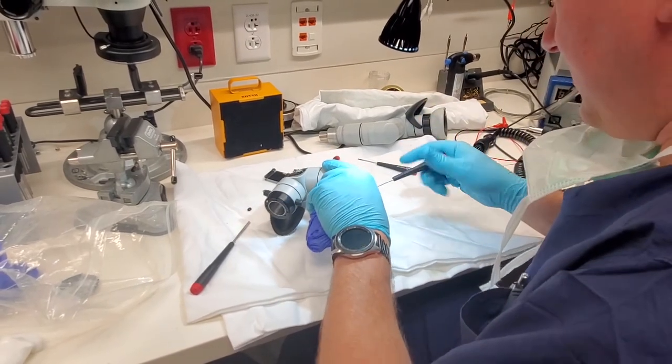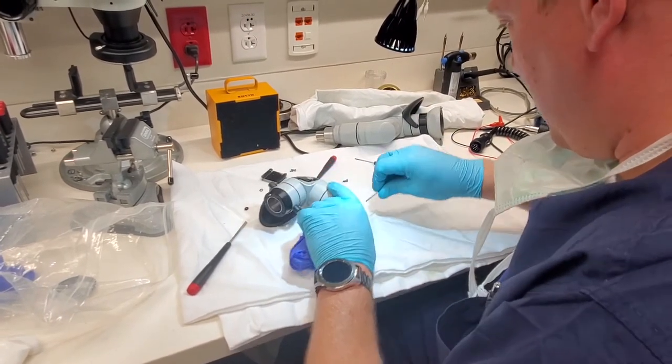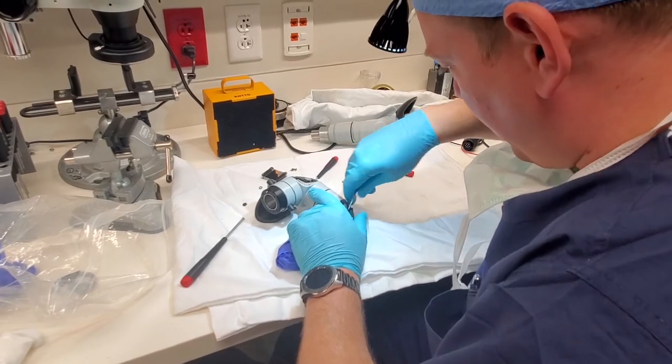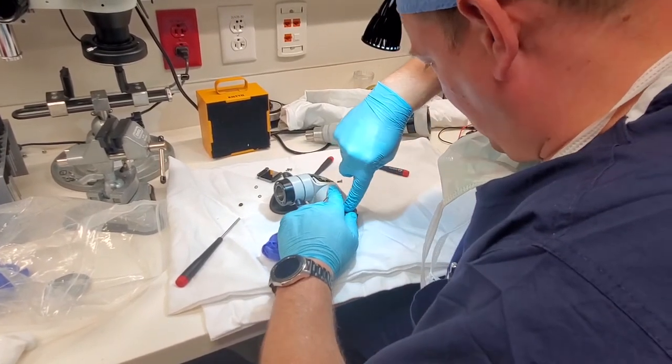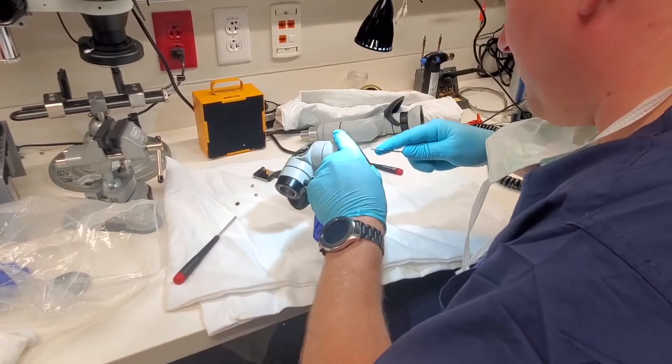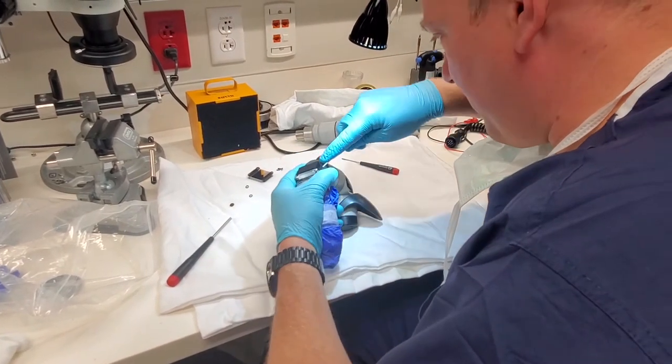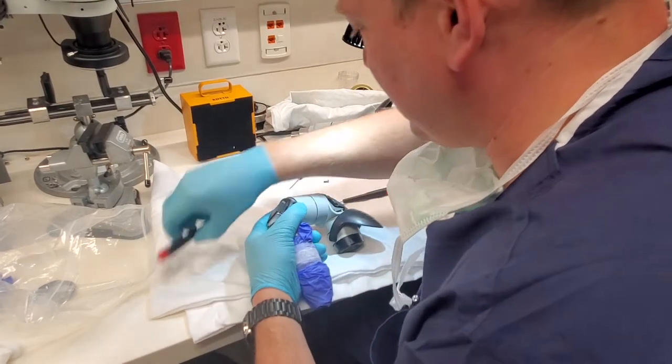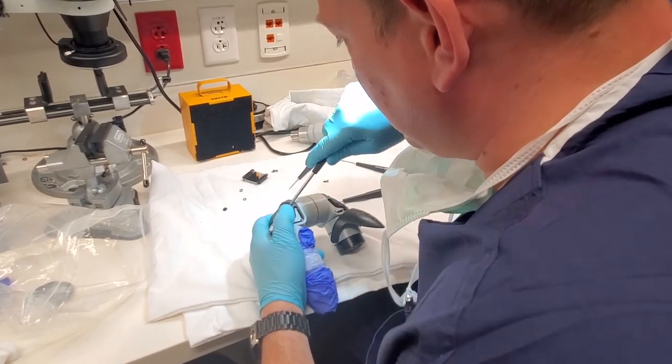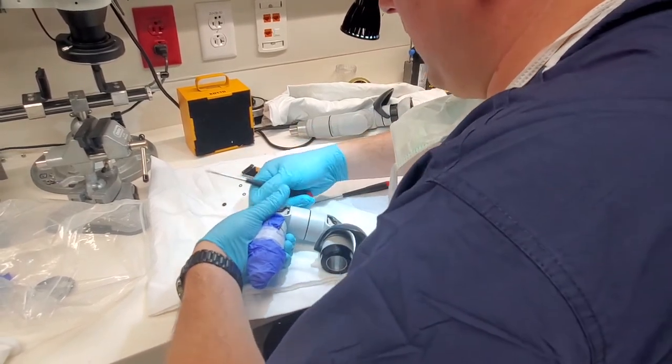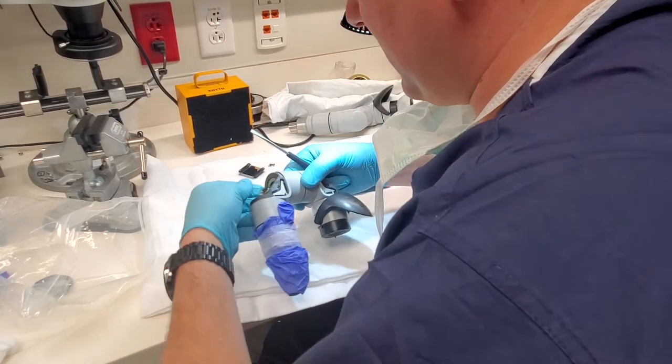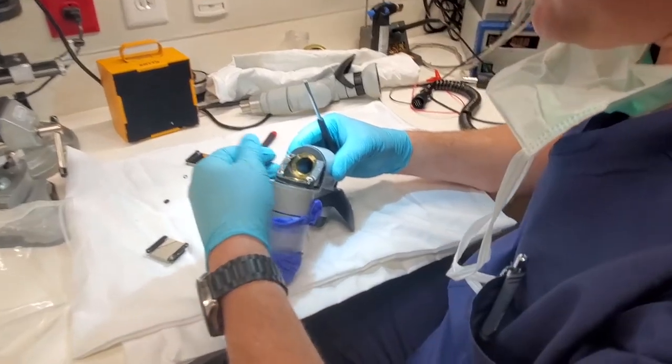These locking observer tubes can retail from four thousand to nine thousand dollars so they're not cheap. I don't recommend people just start tearing them apart. I've done quite a few of these, I've fixed them, and this guy here is just my demo unit so it doesn't really matter.